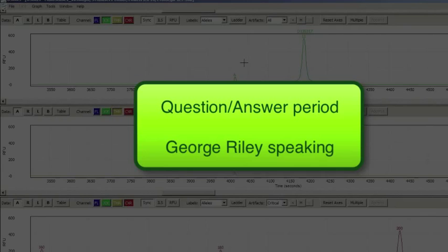Is it possible to add more than one label for a plot? The answer to that is not yet, but very soon. That's actually been developed by some collaborators at Wright State University. And that is something that we're going to put in probably, although possibly not this next release, which is out very soon, but almost certainly in the release following that, which shouldn't be that far off.